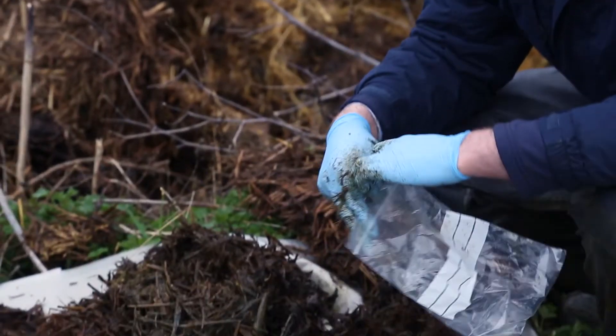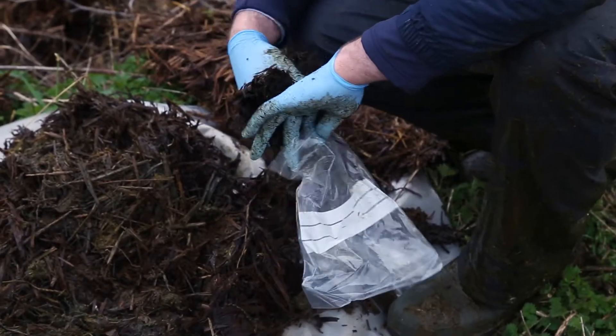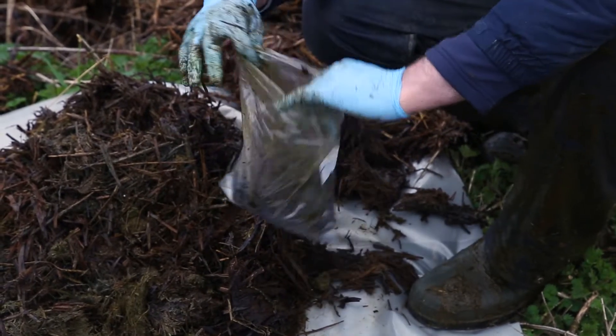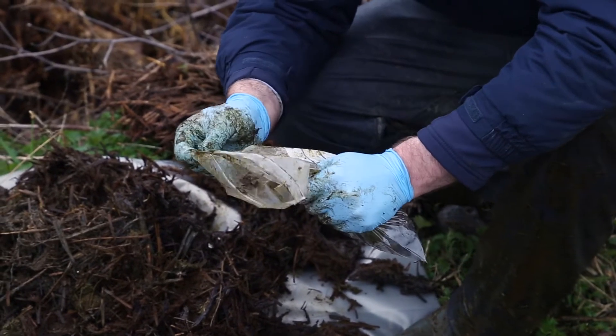We then take at least half a kilo and place it into our sealable plastic bag. When we're content with this, we put it in our plastic bag and make sure that we expel any air that might be in the bag itself and ensure that it is sealed correctly.